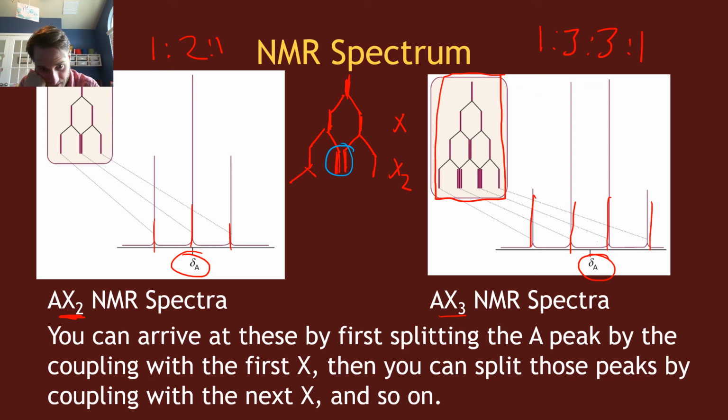And then these peaks split again, and each one of these two splits. I didn't give myself a lot of room here. Oh, I drew that wrong.